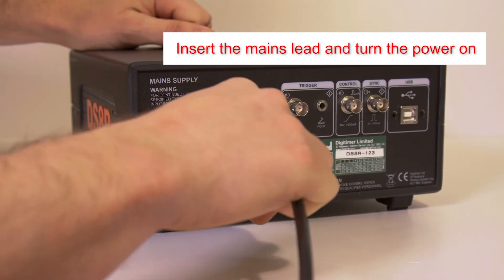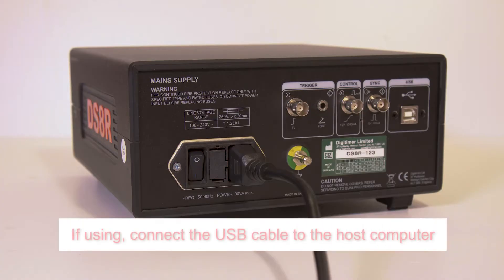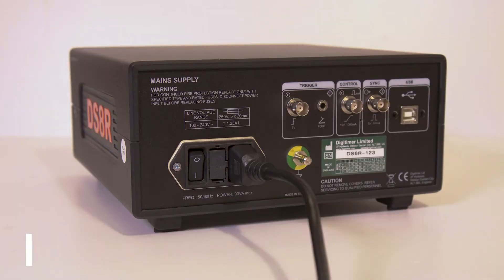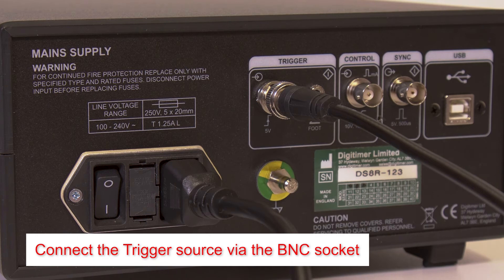Insert the mains lead and turn the power on. For connection to a host computer, connect the supplied USB cable between the DS8R and the USB port on the PC. If using an external trigger source, connect it to the trigger socket using a BNC cable.